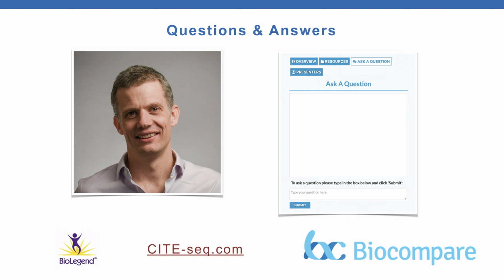So beyond performing titrations to achieve optimal signal to noise, we found that when constructing large panels, it's really important to get balanced panels as well, which can sometimes mean making sure that we don't have some very dominant marker completely taking up all the sequencing space. But I guess in terms of actually doing titrations, we do them as much as we can.